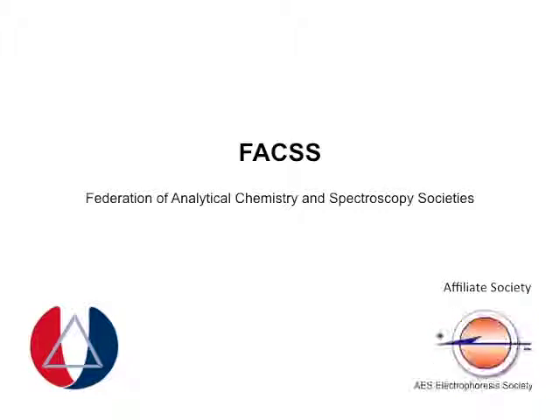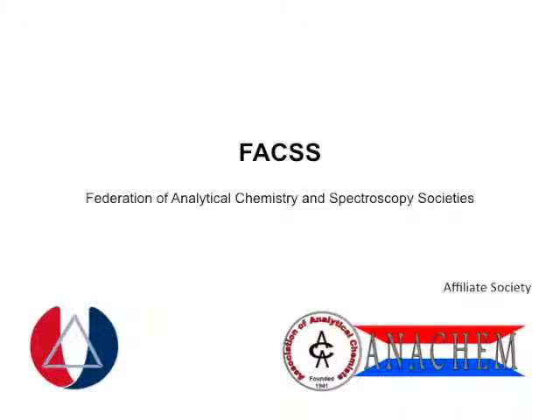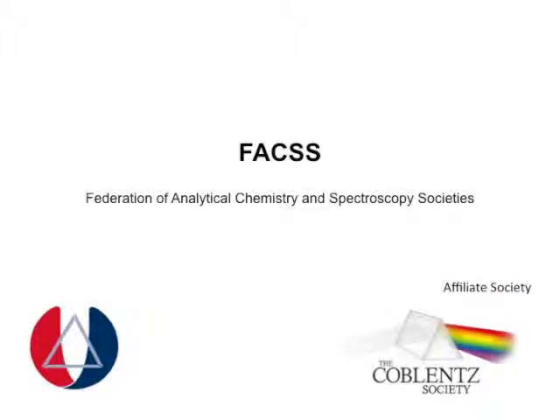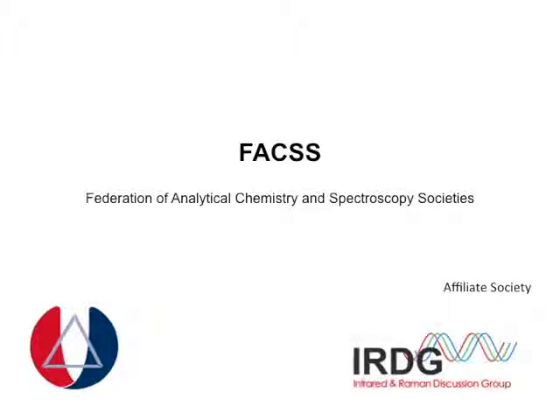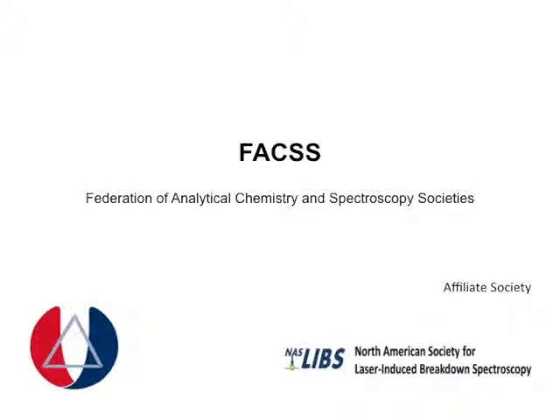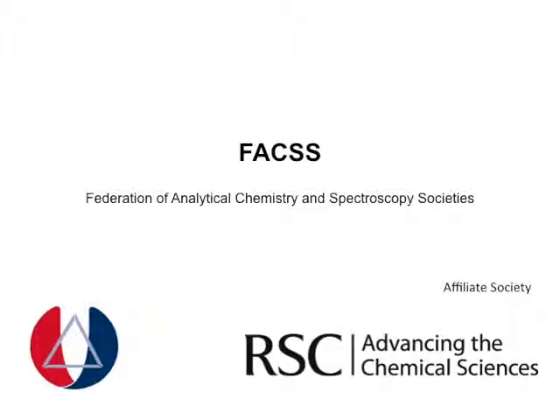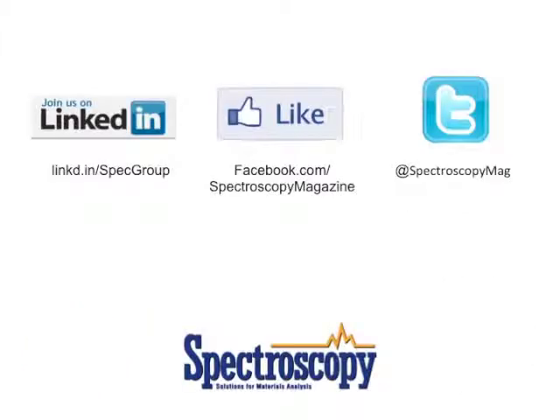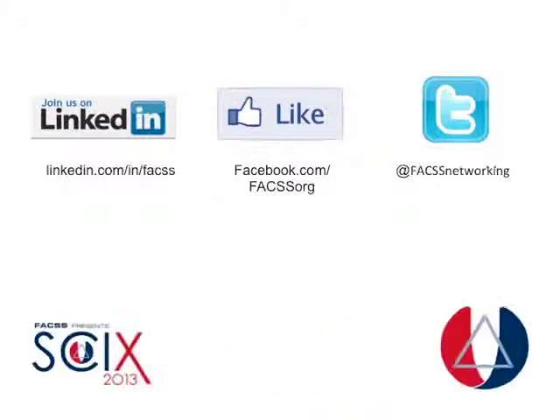How does the technique compare with traditional confocal microscopy in terms of resolution and other parameters? So the closest imaging technique to what we do is fluorescence lifetime imaging, sometimes called FLIM. And that's a diffraction-limited imaging technique. So the spatial resolution is going to be somewhere in the region of 200 nanometers. You're not able to distinguish between two objects or two features of an image if they're separated by less than 200 nanometers if you have a densely populated sample of fluorophores.